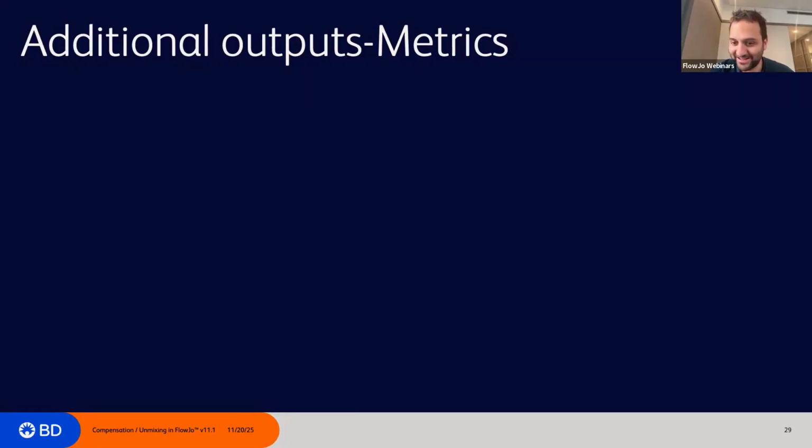Sebastian, hi, I have a question. Can more than one autofluorescent population be used to create a matrix, beads and bigger cells?